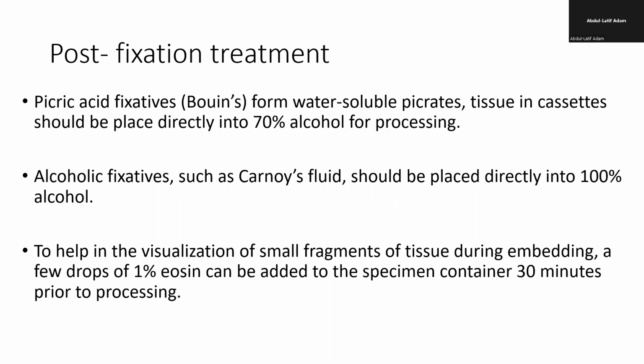Okay, so in that case, you have put the sample in alcohol, and alcohol is a dehydrating solution. So after that, you don't go back and put the tissue in formalin. So you just drop the tissue in absolute ethanol to complete the dehydration.